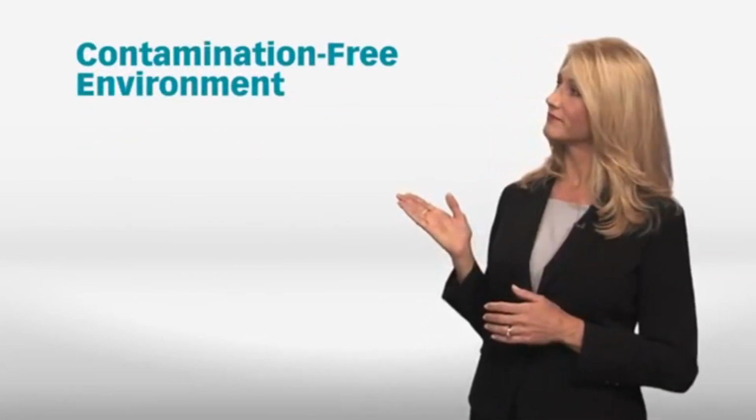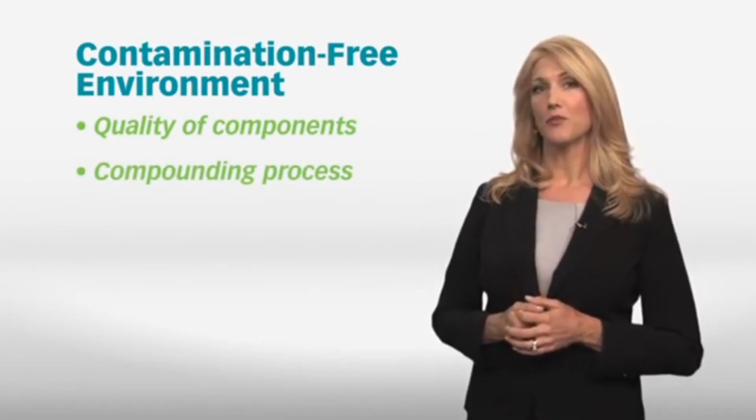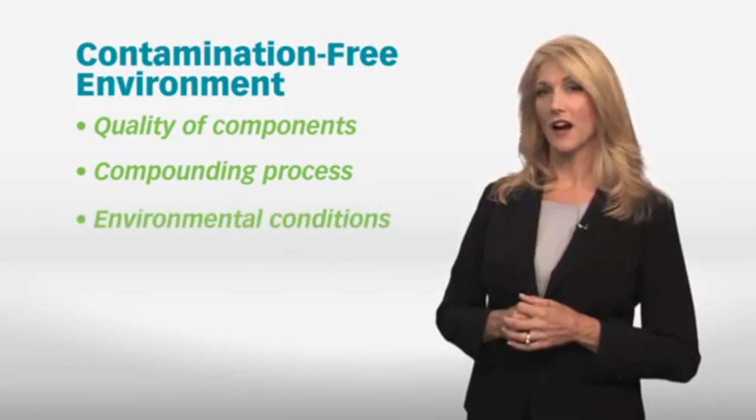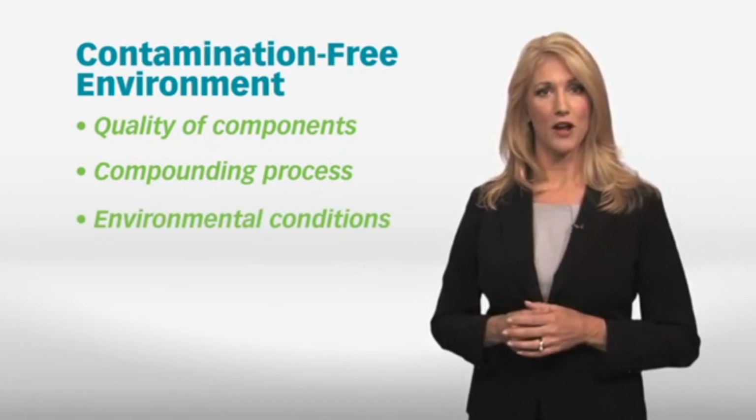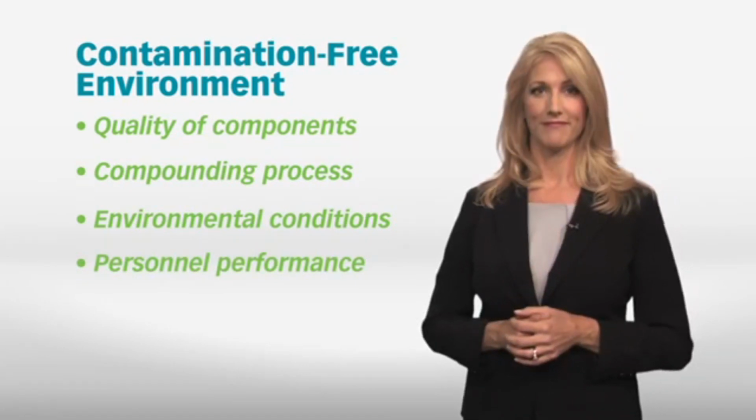Achieving, then maintaining sterility and a contamination-free environment results from the quality of components, the compounding process used, environmental conditions during the compounding process, and, most importantly, personnel performance.